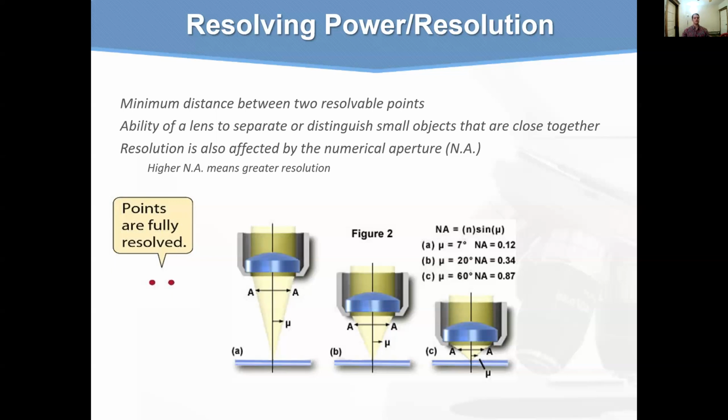The sum of the aperture angles of the objective and the condenser is referred to as the working aperture. If the condenser aperture angle matches the objective, maximum resolution is obtained. I wouldn't break your heads about this too much. Go through this portion of text in your books. Make sure you understand the general take-home message of how the light is captured: you want as much light captured as possible so that you can distinguish the detail, and that refraction, in this case losing light, would be very, very bad.